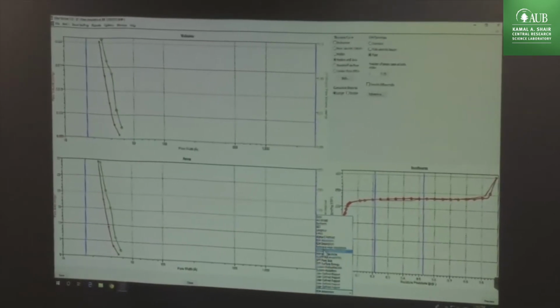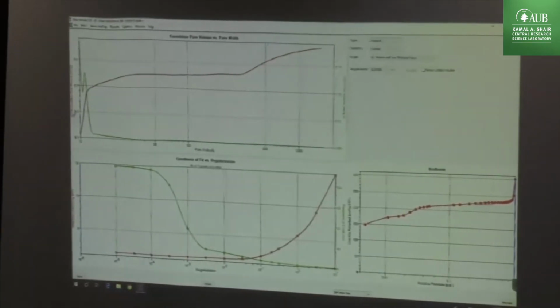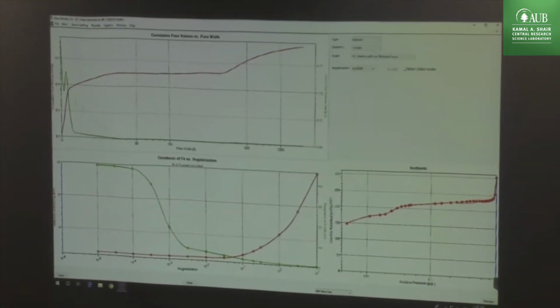Let's see, for example, the DFT pore size distribution. We come here, it says DFT, classical DFT. Okay, and this is the shape. You have in this case slit or cylinder. Remember, you need to download our program for all the models. Okay, so if I get, for example, cylinders and get the model Halsey thickness. Okay, it shows you the micropores only. It shows a little bit here the mesopores, nothing, but only the micropores in your sample. Okay, if I take it like this, for example.